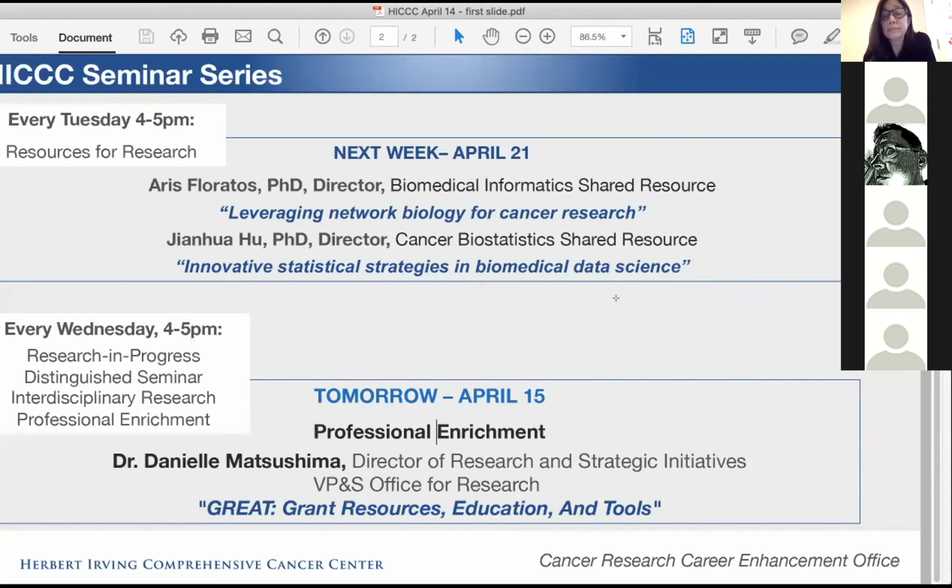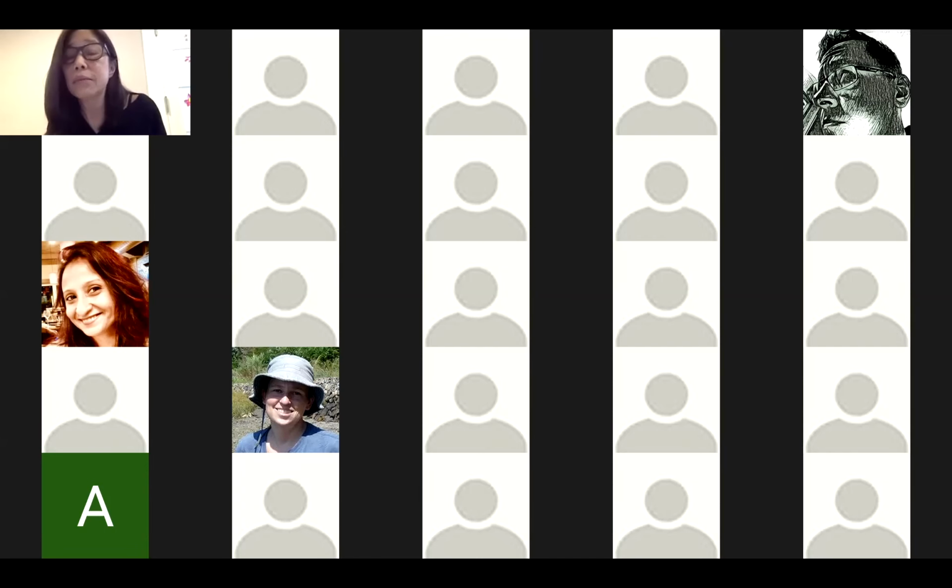Can you image uptake of macromolecular complexes, FITC conjugated, in real time? We're equipped with TIRF microscopy so that we can see uptake of things at the cell surface. So yes, and I'm not sure how quick the uptake is, but the TIRF is probably the best application, and we're certainly equipped to do that.